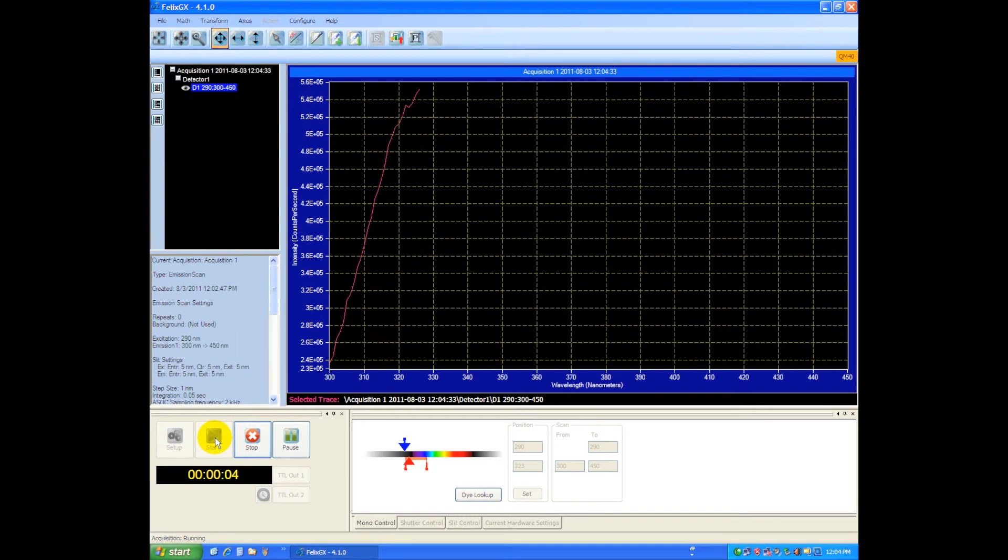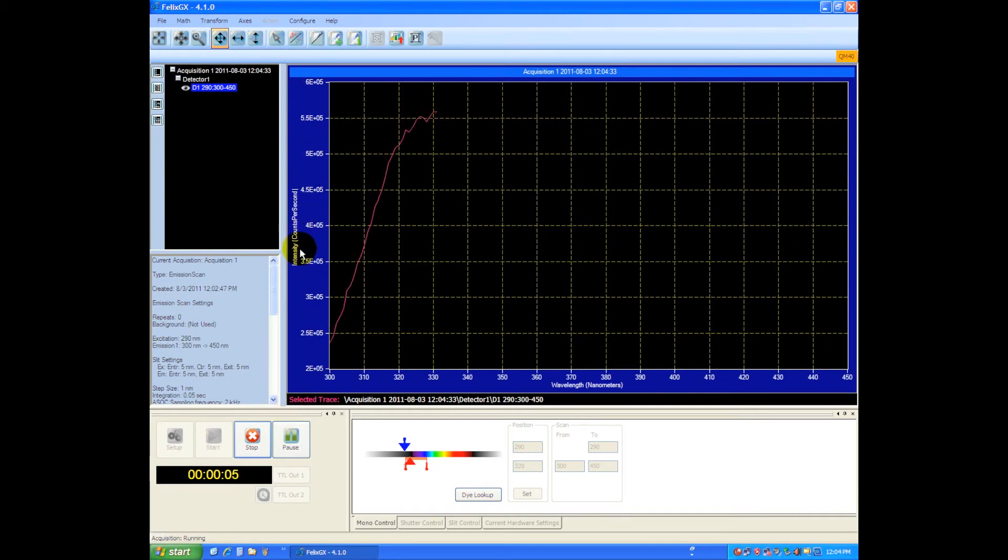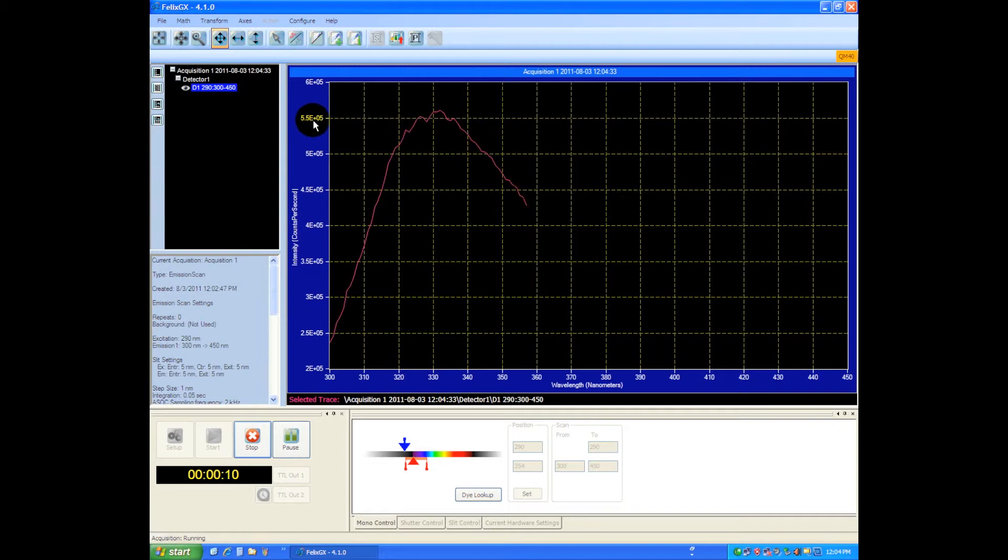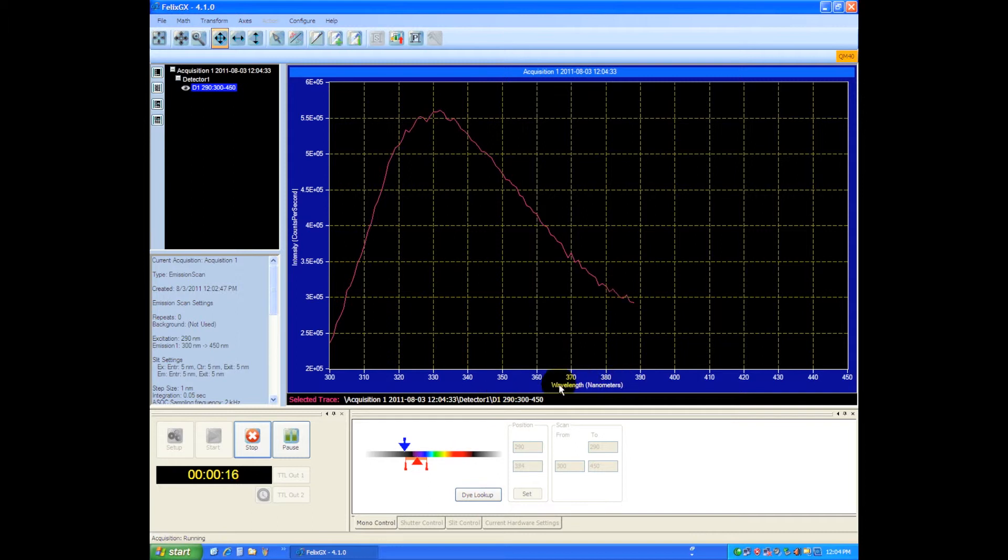On this side you've got your intensity in counts per second. So we're sitting at 5.5, so that's 550,000 counts per second in digital mode, and down here you can see this axis is wavelengths in nanometers. So this scan will be finished at 450 nanometers.